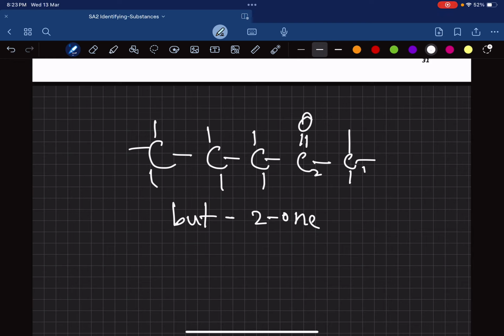Currently, I want you to notice there is no symmetry, which means that I cannot cut the molecule anywhere here which allows me to get 2 halves which look the same. So there is no symmetry. So this means that this carbon, this carbon, this carbon, this carbon, they are all in different environments. So for carbon signal 0 to 220 or 240, you will get equal height signals, 5 of them. So this basically tells you they're all in different environments.